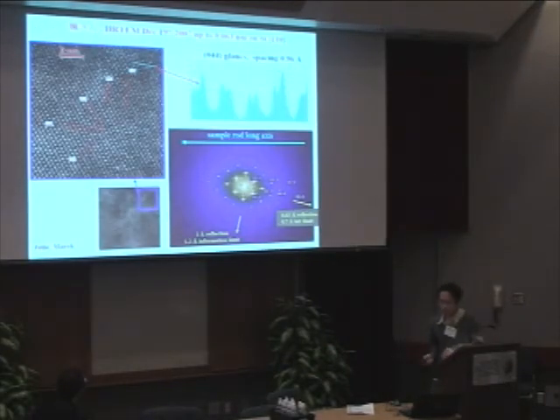Due to the very good performance of the electron emitter, it gives you a very coherent electron beam. You can see this sort of high resolution lattice image routinely with both machines. Here is a lattice image of a silicon sample from the 110 direction, and you can see the spacing of those two atom columns. You can view features as small as 0.9 angstrom.